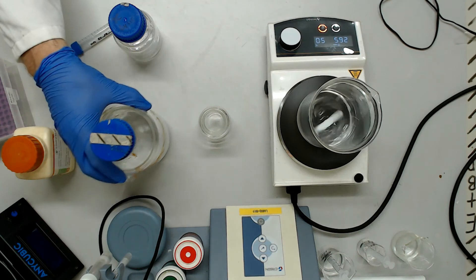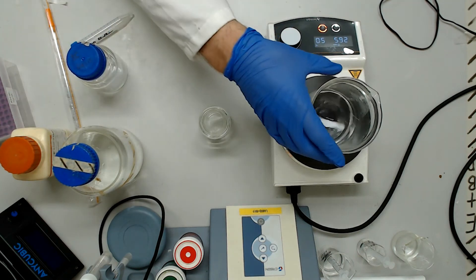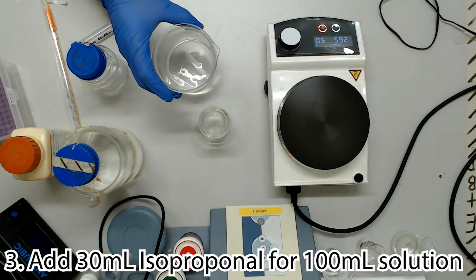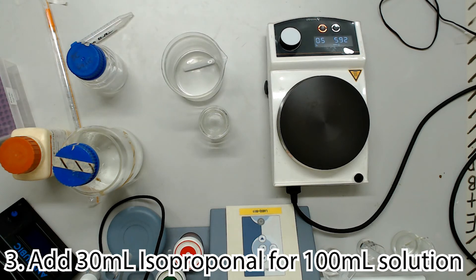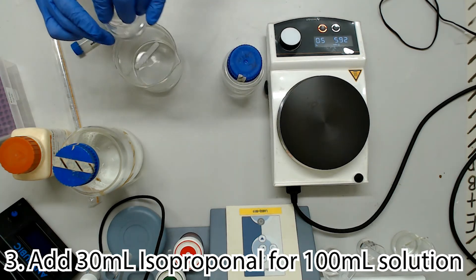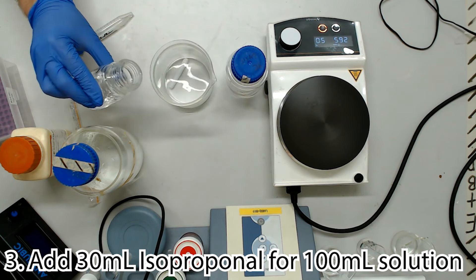Has all your salt dissolved yet, or shall I keep rambling? Oh, it looks like we're done! We're now going to add some isopropanol equal to 30% of the intended stock volume for our buffer. Since it's 100 mils here, I'll be adding 30 mils of isopropanol.